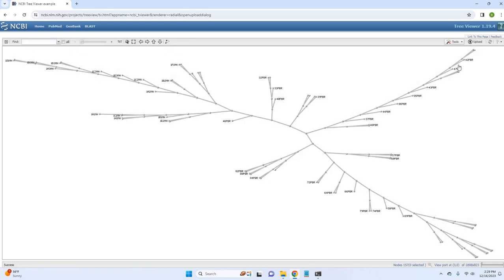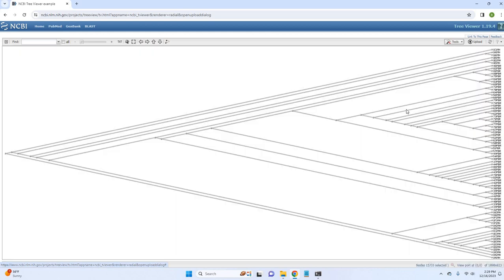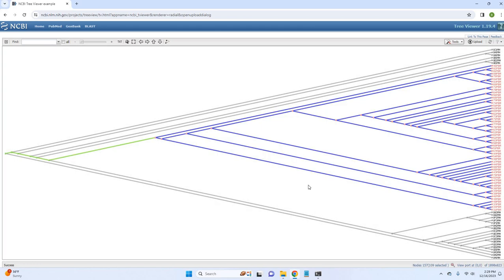Okay, here we go. We can change the format or the layout. Standard diagram. This is PBR. You can see the farthest away from the base is patients before radiation, all cancer, no mix and match. And here, the closest to the base is healthy.